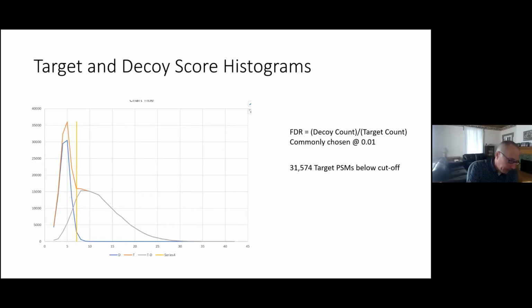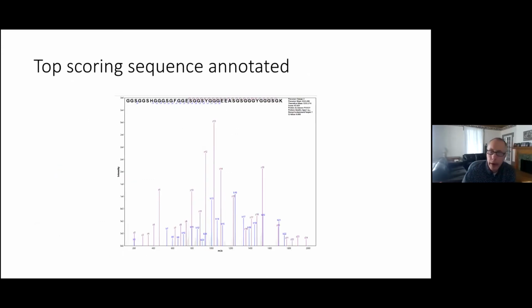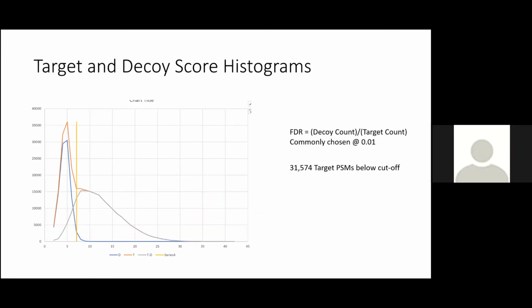Mhm. All right, so I'm just going to show two annotated... I'm sorry. I actually have one last question about units. So the unit here is the spectrum, the peptide spectral match. Maybe you'll talk about how we aggregate to the peptide level?